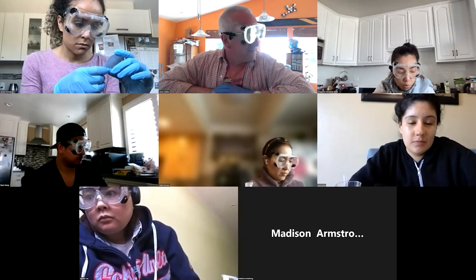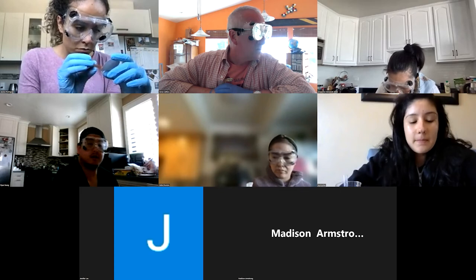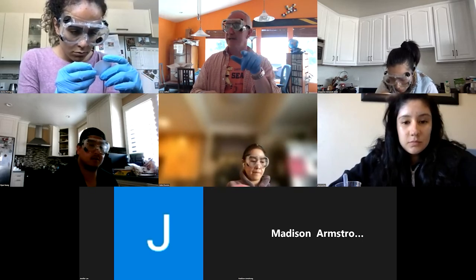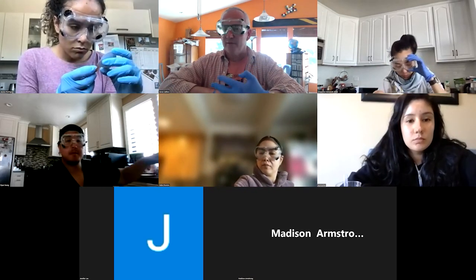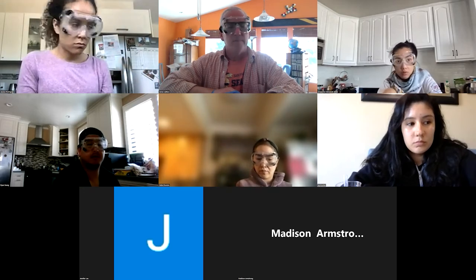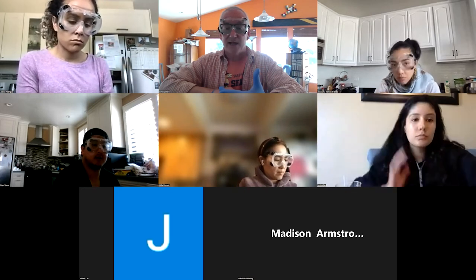Oh man, so it seems like all the commercial stuff has been treated to get it to a neutral pH. That makes sense. That's why I figured if someone had some natural soap, actually we do have some natural. I should have tried that. I'm going to test that. We've got some soap we bought at a farmer's market, and I want to see if that has more of an alkali nature to it. Although that's probably treated to bring it to a more neutral pH as well. But I will test that. So everyone's got neutral to slightly acidic pH so far.